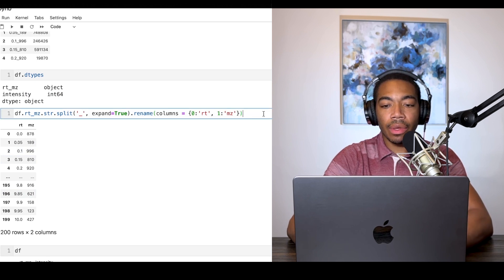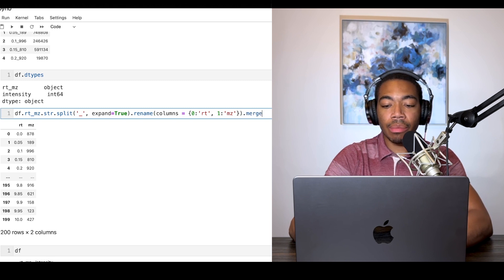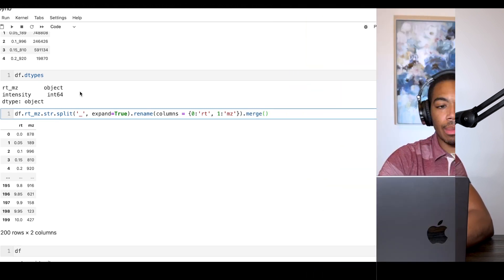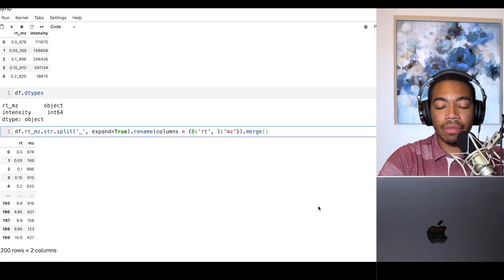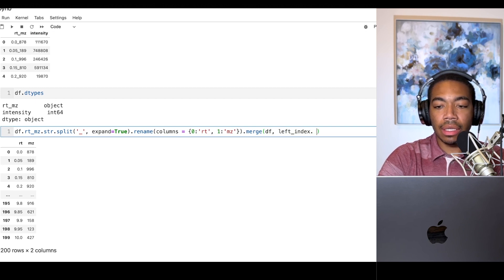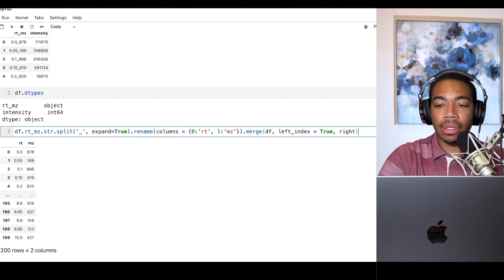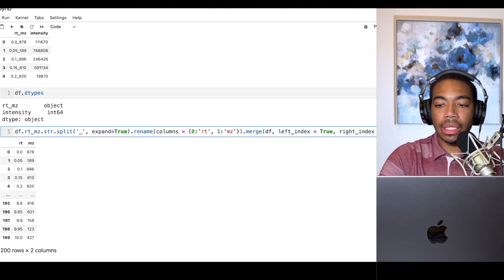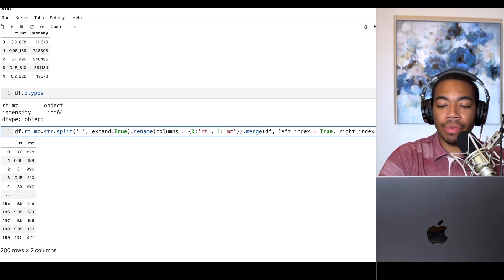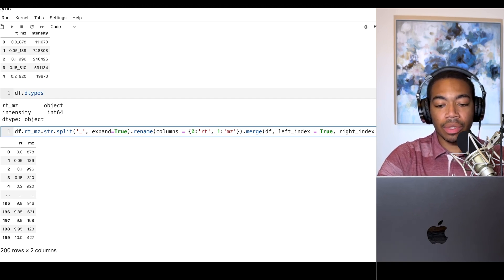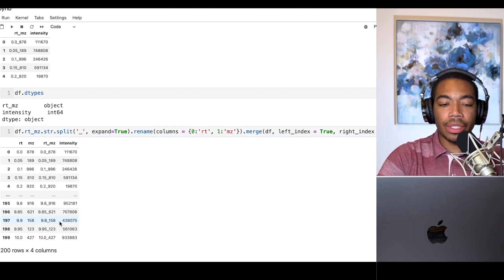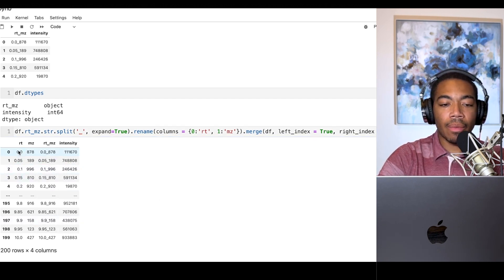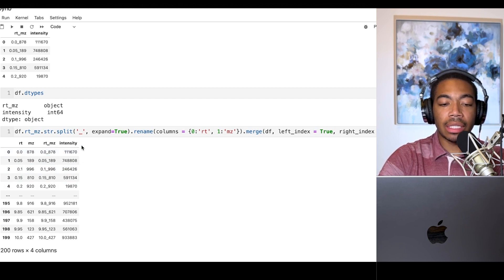We run the dot merge method and merge our right dataframe, which is df, and we'll just say left_index equals true and right_index equals true. This is the case because both of these dataframes come from the same original dataframe, so we know that indices match. When we run this you see that we have our dataframe now where the m over z and retention time have been split and we have our original intensity column.